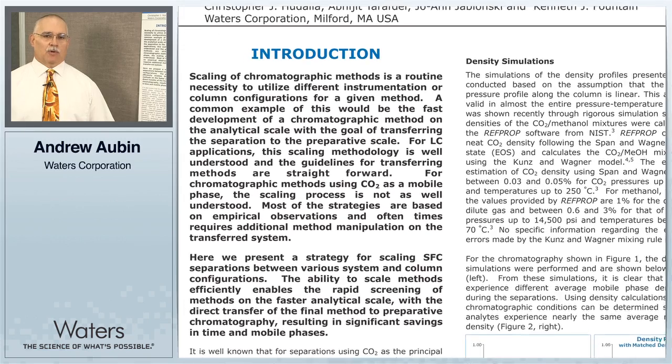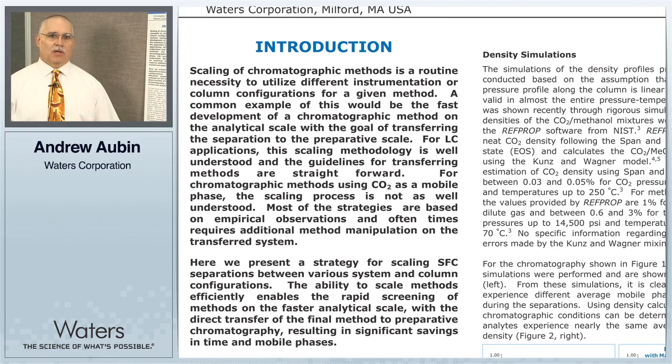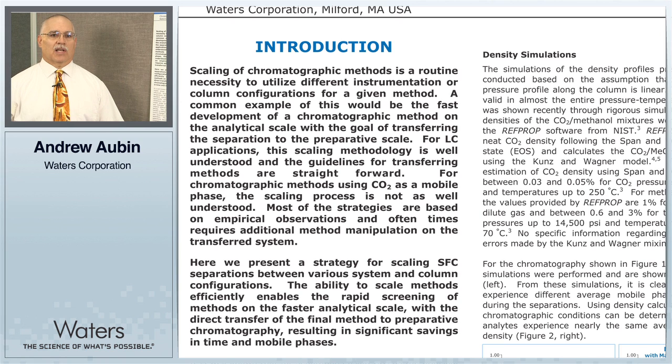Scaling methods in liquid chromatography is well established and well understood. Unfortunately, the same cannot be said for scaling methods in supercritical fluid chromatography. In this presentation, I'd like to discuss some of the things that make scaling in SFC challenging and some of the factors that influence scaling success in supercritical fluid chromatography.